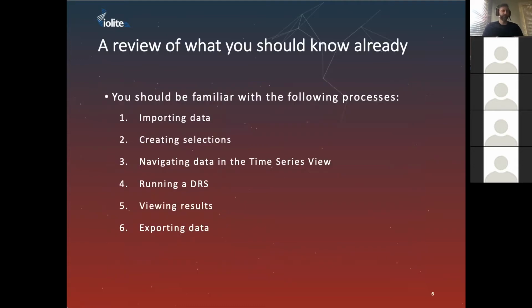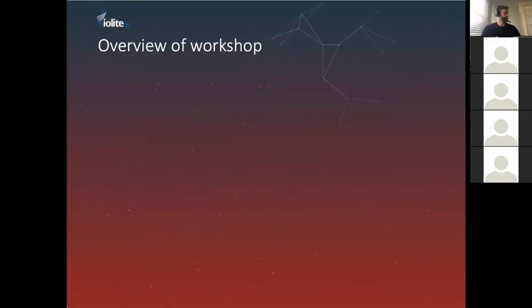So just to let you know, we won't be covering the basics in this webinar. They're all covered in the basics webinar. So hopefully you're familiar with importing data, creating selections, and running a DRS. If you're not, for imaging, these things are pretty basic, but we do recommend you check out the recording of that webinar if you haven't seen it before.